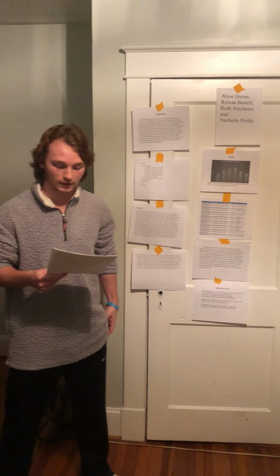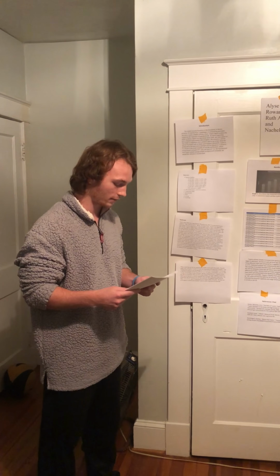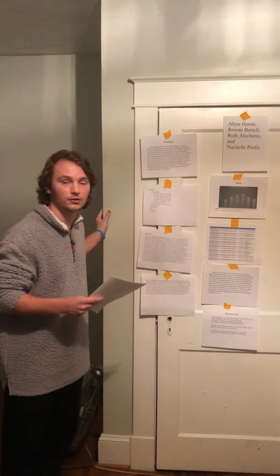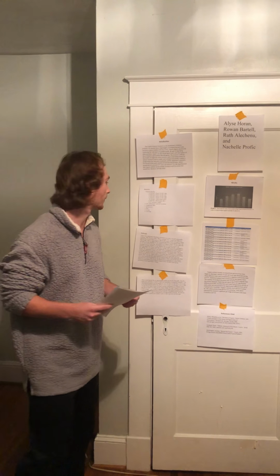It is found in the small intestine of animals and humans, where its temperature is 37 degrees and its pH is 7.5. We hypothesized that the trypsin activity would initially increase as pH increases, but then eventually denature at a certain optimal value and then decrease.